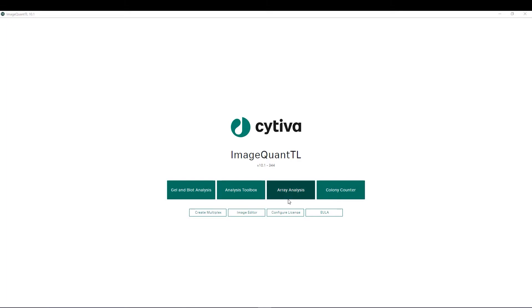The array analysis module can be utilized for analyzing spots in an ordered array such as a 96 well plate or a microarray. Finally, the colony counter module can be utilized to quickly and efficiently count colonies.